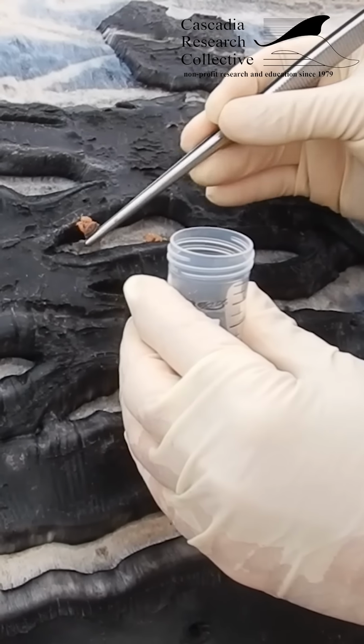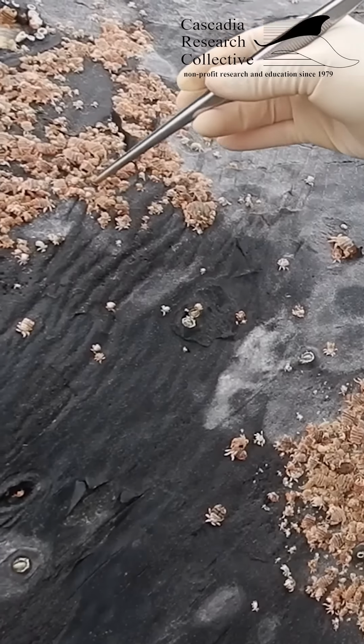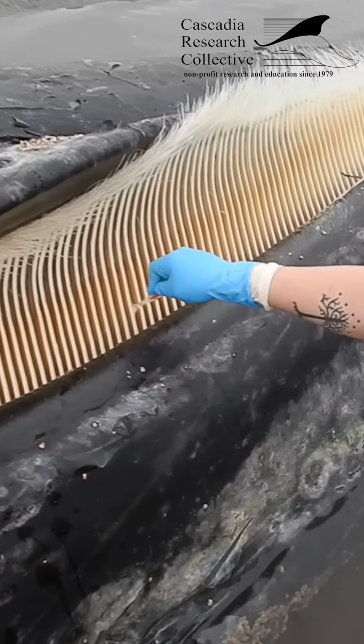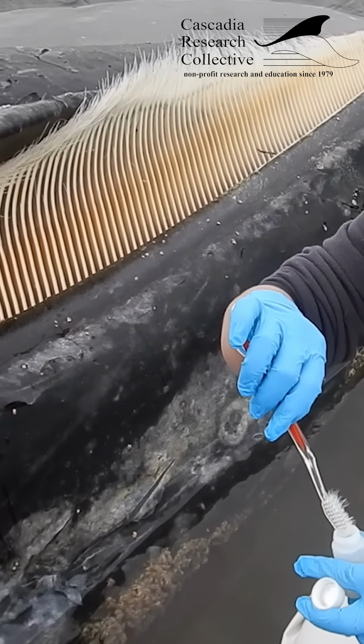We also collect external parasites, such as cyamids or whale lice. Different areas of the body can have different kinds of whale lice. Another organism commonly found in whales are photosynthesizing algae called diatoms, collected from the skin and baleen. Diatoms are believed to produce 20 to 50% of the oxygen that we use.